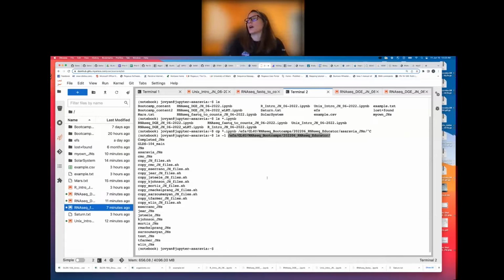And so what you're going to do is, again, that copy command. Oh, I never actually ran it. So it's going to be cp, the one I put in the chat, the *.ipynb, again, because we're in our home directory.